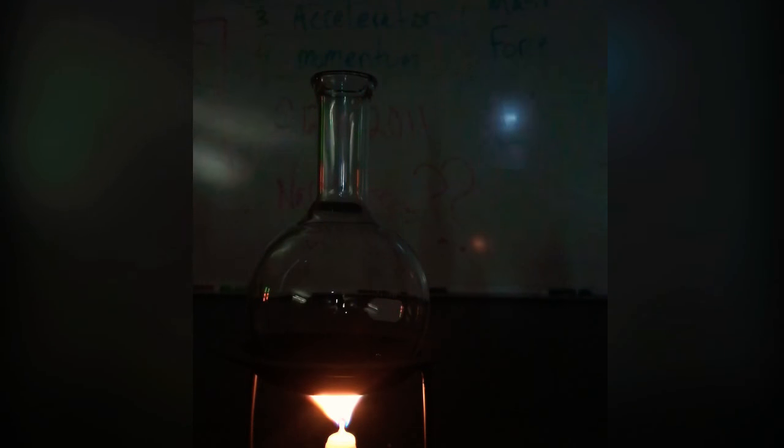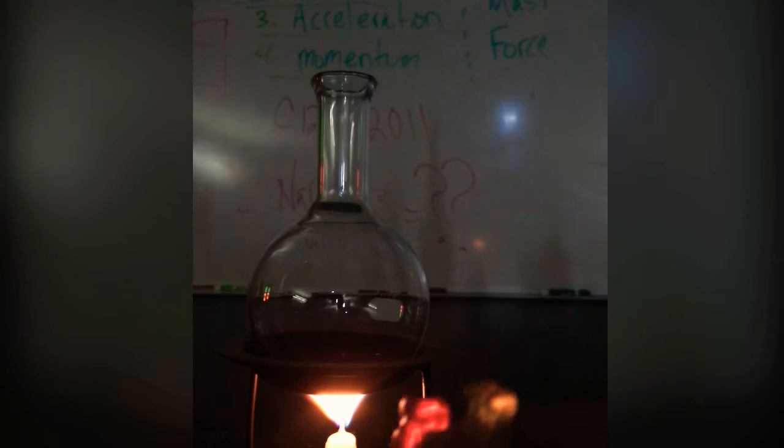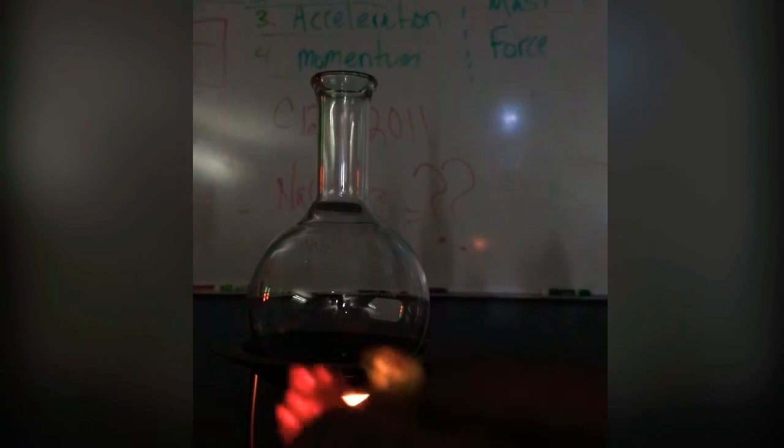You're going to see this oxygen get released, okay? And all the sugar that's inside of these gummy bears, once it hits that temperature of that potassium chlorate, all this oxygen is going to explode. But that's not the cool part, and that's where you're going to get to see the gas. You're going to see these awesome gases come out.